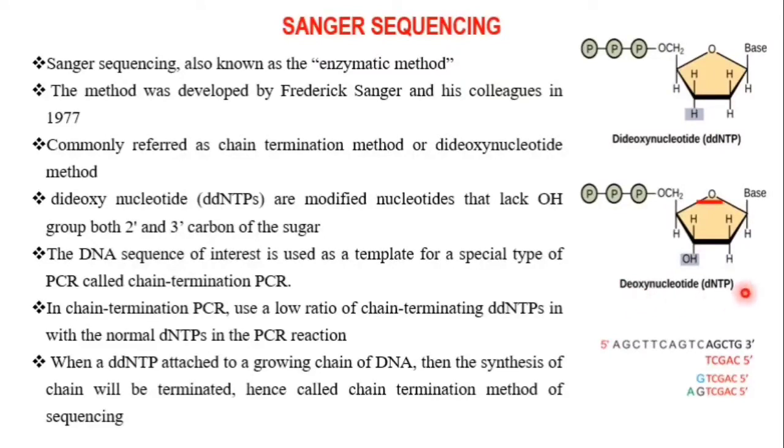So you can see here, in the second position the hydroxyl group is removed in the case of deoxynucleotide, but in the third carbon the hydroxyl group is there.